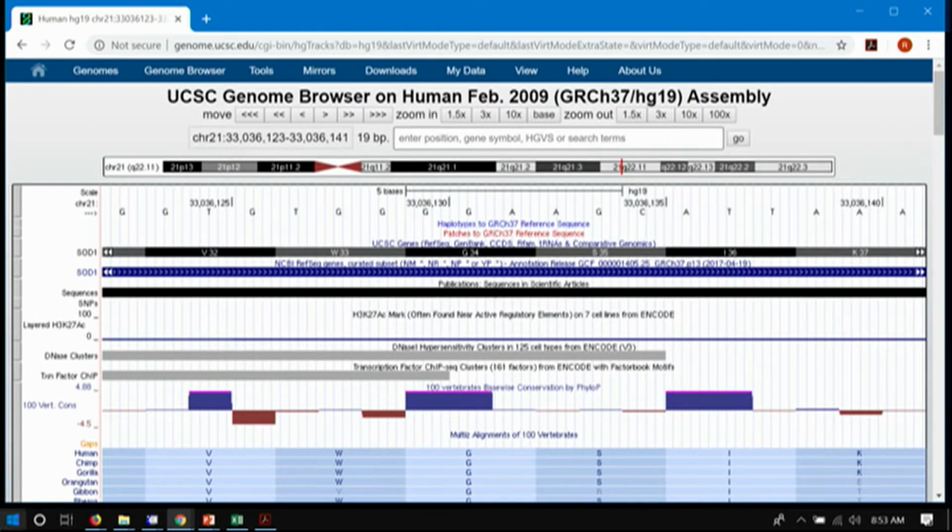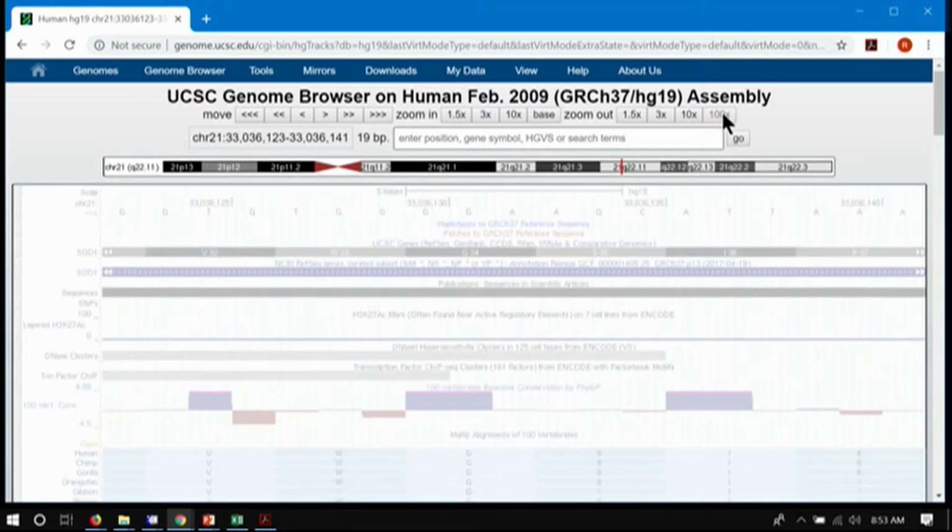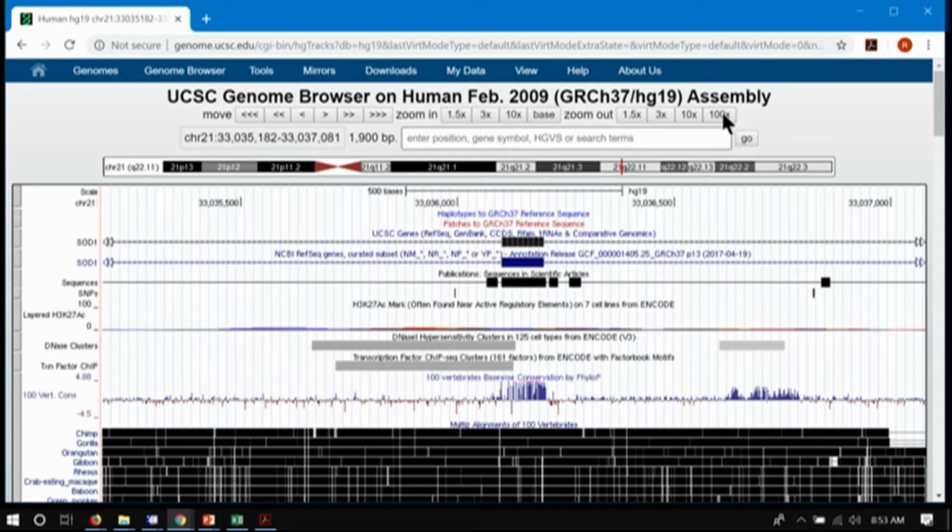Using the right mouse button, I'm going to, before I do, let's zoom out by a factor of 100. I want to show you something that's kind of interesting about the signal. So here's an exon in the middle of the page. Okay, so how many of you kind of lost where I was? I clicked and I clicked and I clicked and I moved around and you got lost. Okay, I'm going to save a session so you can all catch up. And you can get exactly this picture, and I'll show you the value of saving sessions.